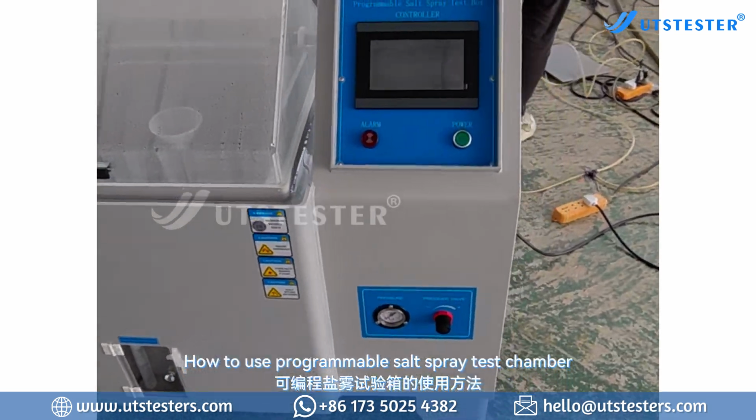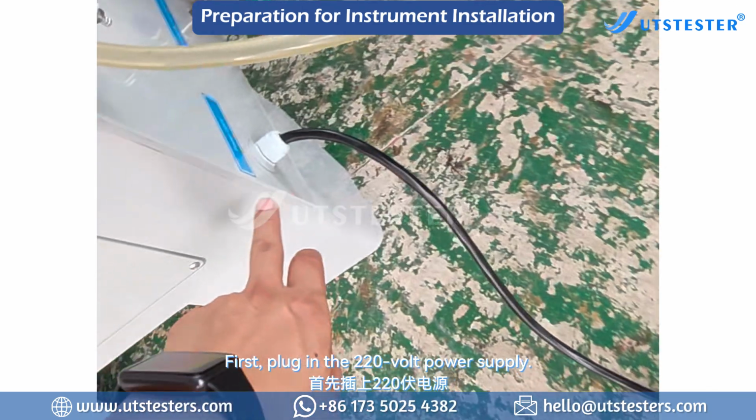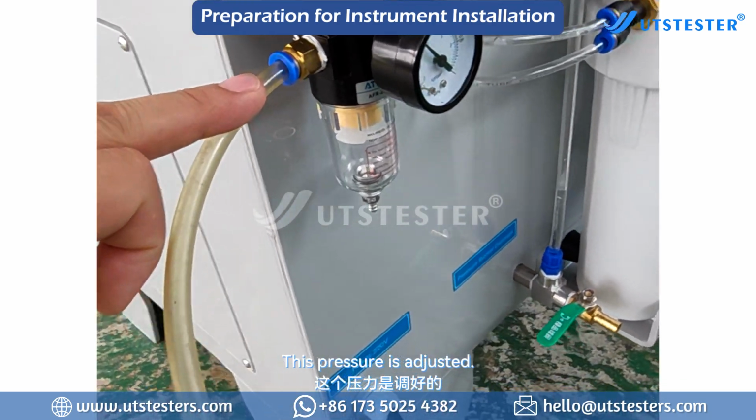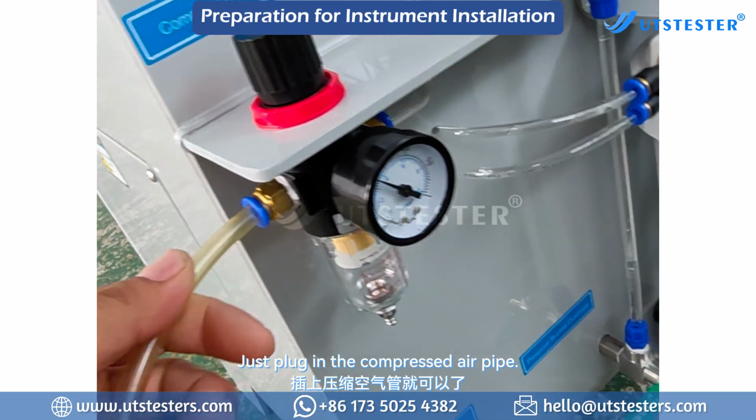About how to use the programmable salt spray test chamber. First, plug in the 220-volt power supply. Connect compressed air. This pressure is already adjusted, so we don't need to tune it again. Just plug in the compressed air pipe.